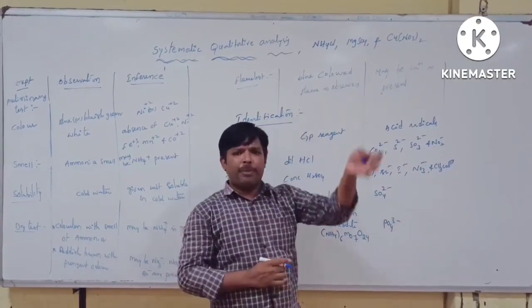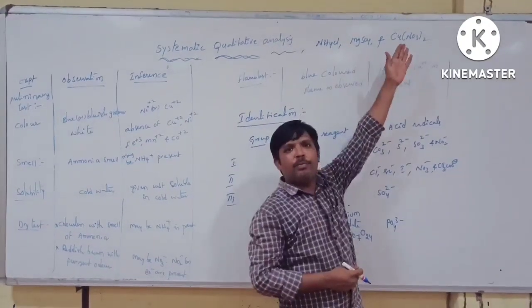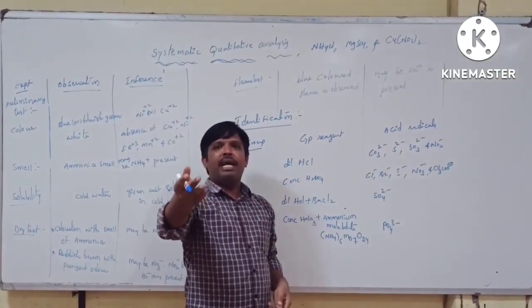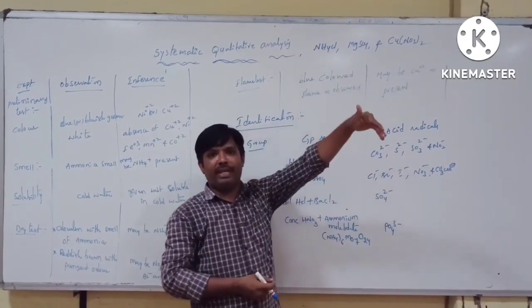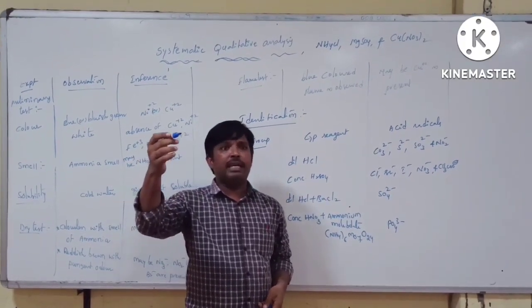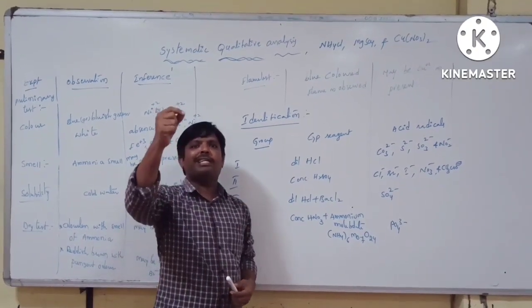చూడండి, within seconds మనం చెప్పొచ్చు. ఏంటి సార్, కాపర్ నైట్రేట్ బ్లూ ఇన్ కలర్ రాగానికి ఏమర్థమైపోవాలి, that is the copper nitrate. Copper is the cation, nitrate is the anion. MgSO4 magnesium sulfate ఎలా గుర్తుపెట్టవచ్చు అంటే, it is a crystal-like compound, మనకి షుగర్ క్రిస్టల్స్ లాగా ఉంటుంది.